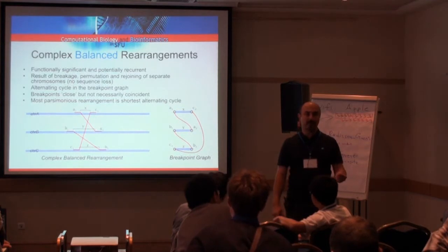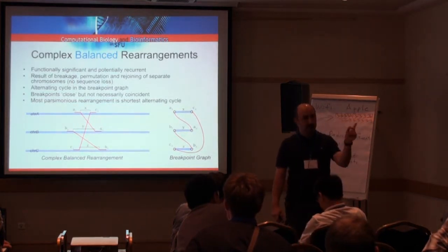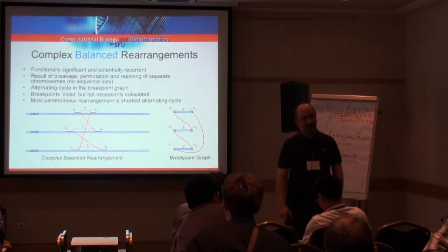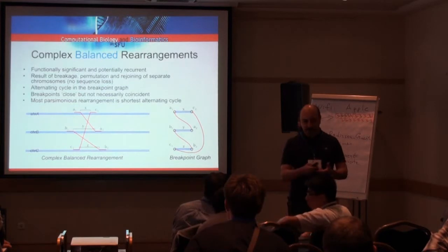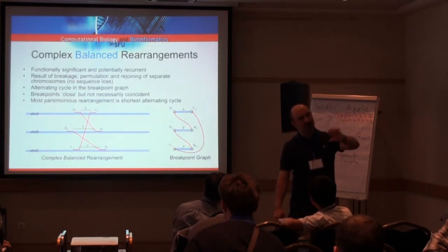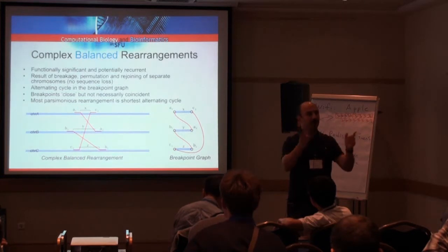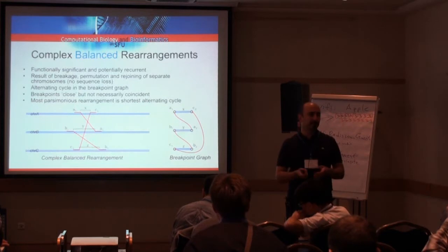Here's what I know. We looked at Fosmid sequence regions, and there are some obvious examples, especially near ALUs. There are obvious deletions, for example. Next to an ALU insert, there will be a deletion. It's obvious because of depth of coverage, or in an inversion. And we know that we missed them.